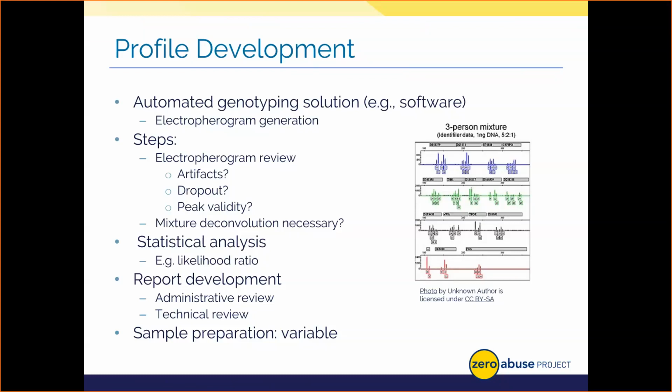Both analytical and stochastic thresholds are used to establish and increase confidence in the accuracy and quality of our electrophoregram profile. We establish these thresholds through extensive validation studies, something I'll talk about in just a little bit. So your electrophoregram can actually be used to tell if there's a possible mixture of 2 or more people. If there is, we can use software to help us deconvolute or separate out profiles from that item. We can only do this with so many people. Typically, your programs only look at deconvoluting 2 to 4 person mixtures. So there's going to be some limits.